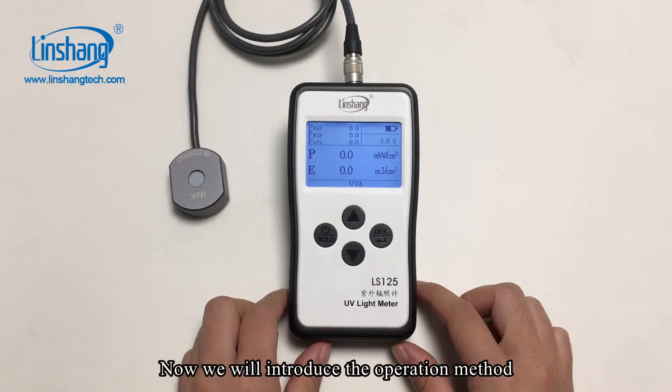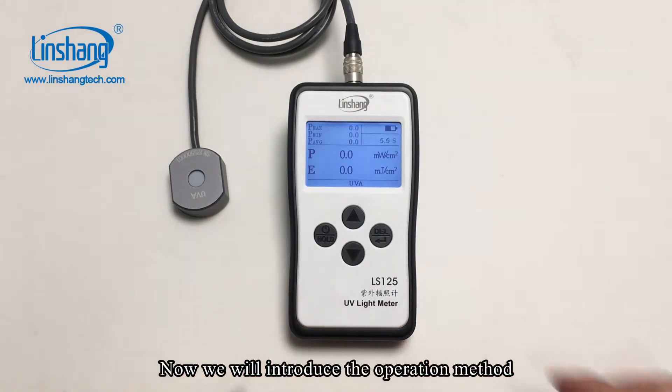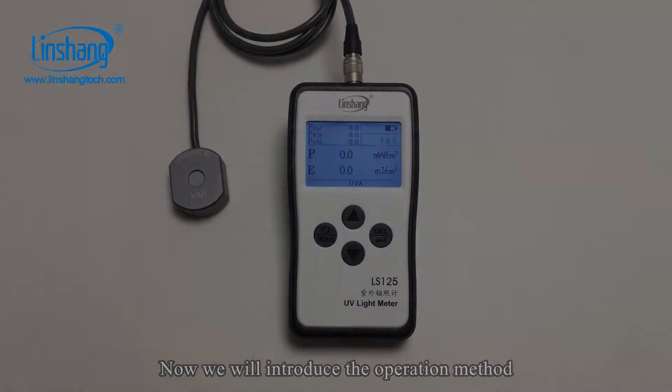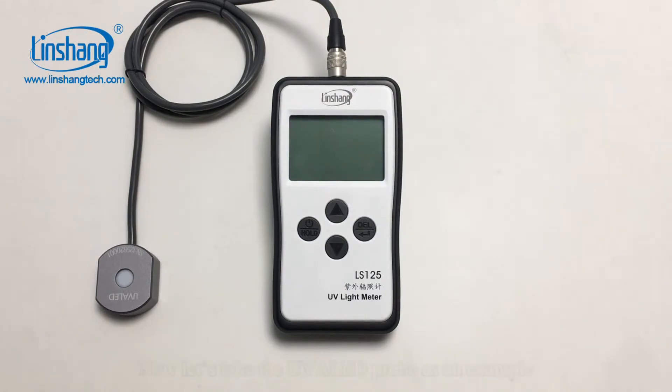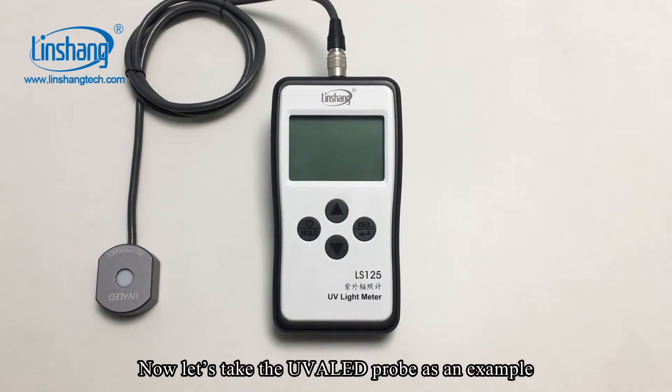Now we will introduce the operation method. The operations of all the probes are similar. We will take the UVA LED probe as an example.